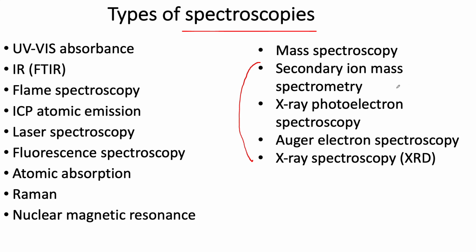Although I have seen something like this done with molecules, where it's more like mass spectrometry. You have a frozen organic sample or a biological sample, and you come in there maybe with a laser, and you ablate some of whatever was on that frozen sample and cause it to go into the gas phase and measure its mass. So there are lots of different variations on these techniques. But secondary ion mass spectrometry is looking at the mass of what was on your surface.